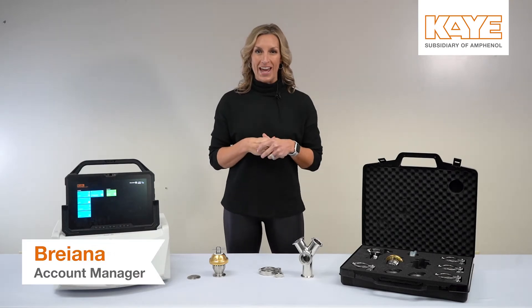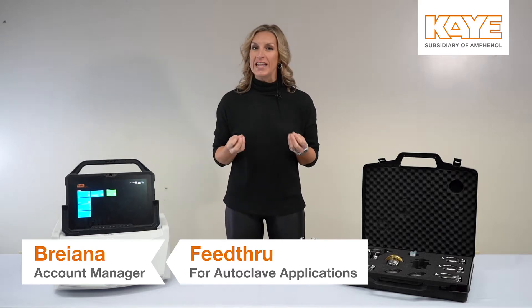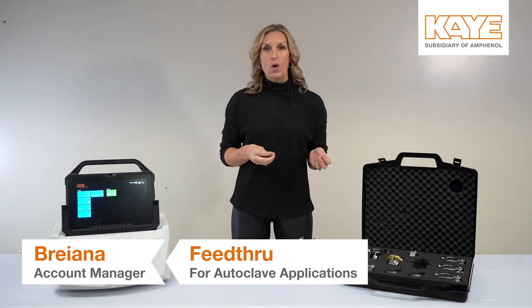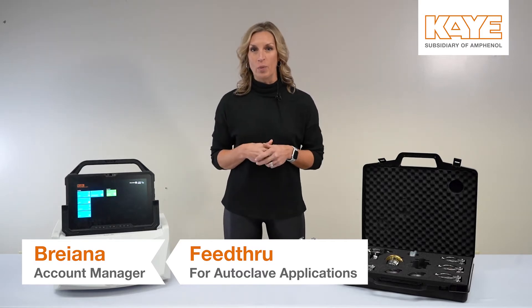Hey everyone, it's Brianna with K, and today I'm highlighting our feed-through for autoclave applications. Our feed-through gives you an easy way to introduce thermocouples into your autoclave chamber while securely sealing your autoclave port. It can accommodate 18 thermocouples at one time, uses the 1.5 tri-clamp connection, and can handle temperatures up to 140 degrees Celsius. We also pride ourselves on our special gaskets that ensure a great seal.